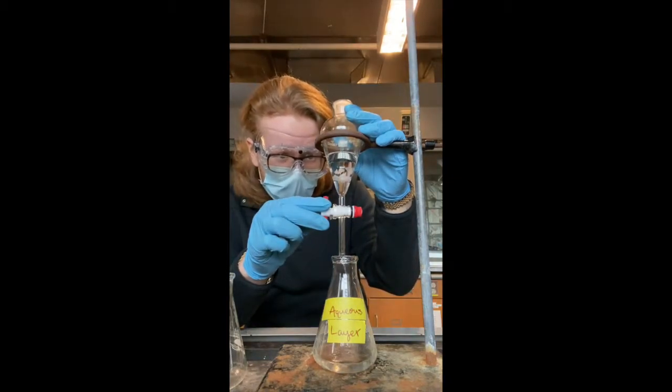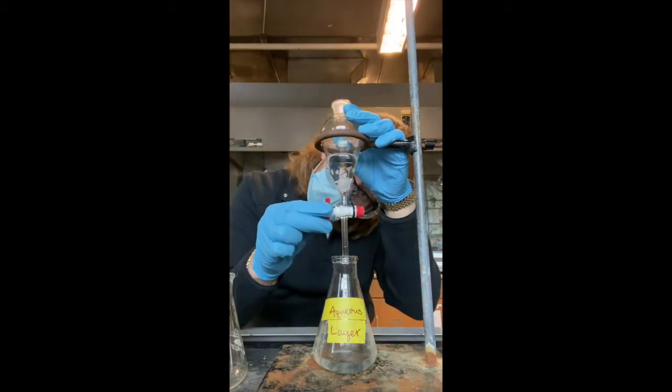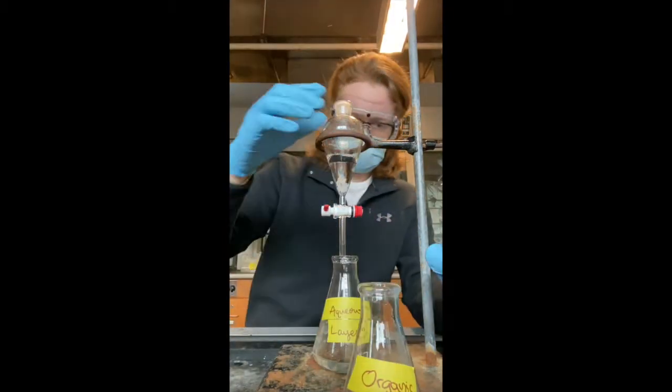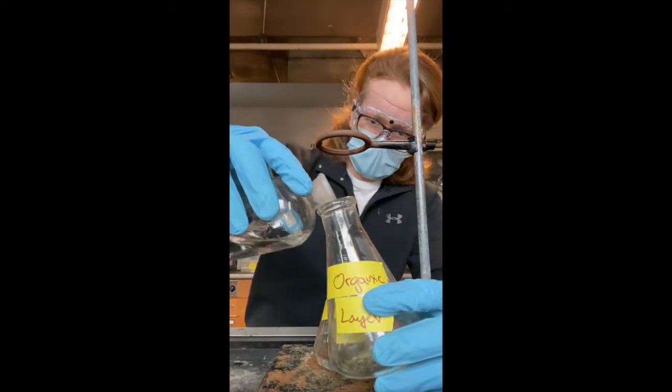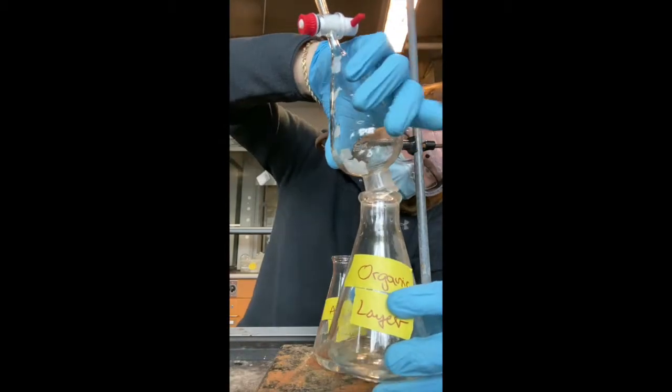As you are draining out the bottom aqueous layer, you will want to slow down as the meniscus reaches the stem of the separatory funnel to ensure that you are able to close the stopcock right before the top organic layer starts to flow through. After that, you will pour out the top organic layer.